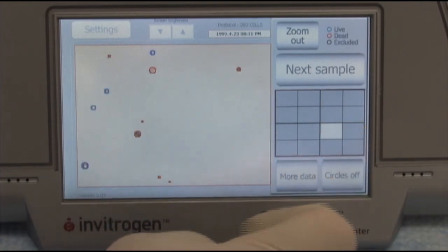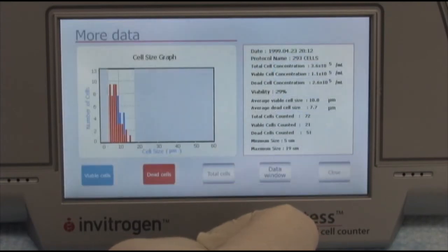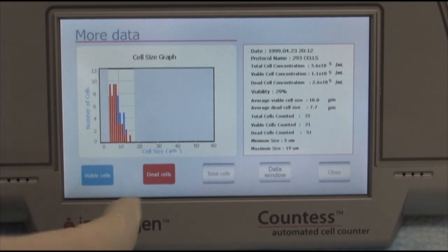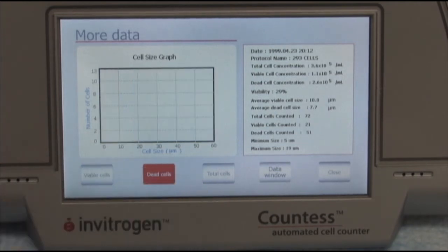You can hit more data. I set the gating in the cell mode parameters to only read particles below 19 and above 5 micrometers.